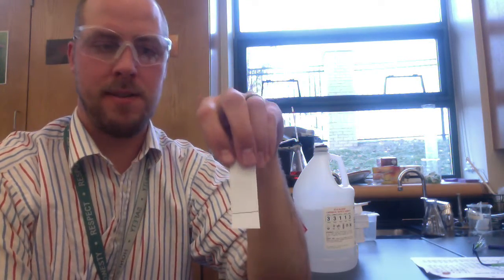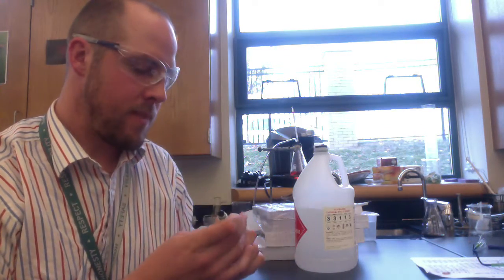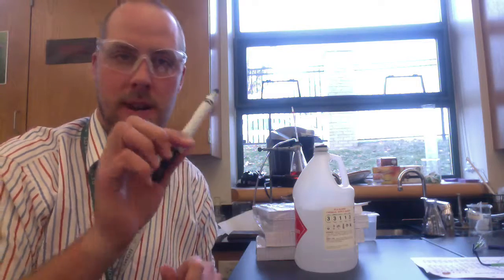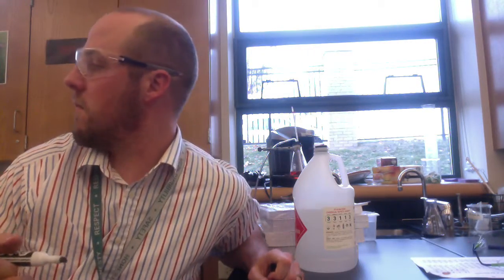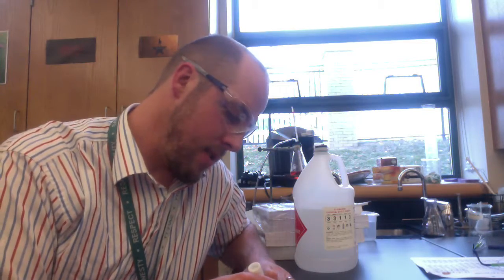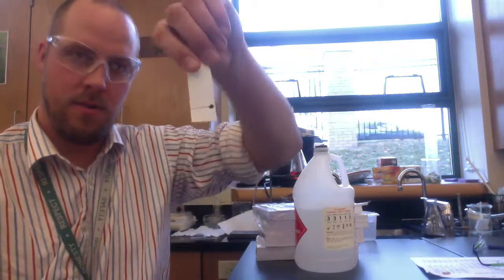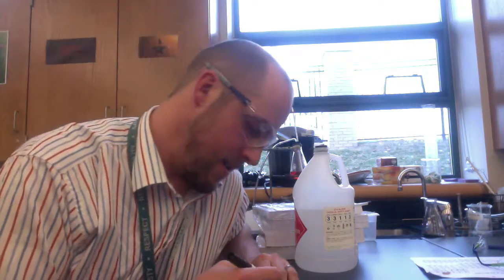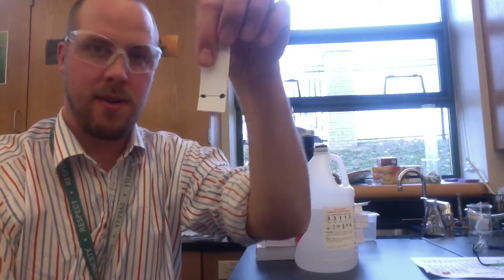So you put your line of pencil on the bottom of your chromatography paper. Then we've got a number of different markers: washable markers being one, or all kinds of permanent markers, dry erase, wet erase, others there as well. So I'm going to put a dot of dry erase right here, and a washable dot on there. So now we've got two different dots.